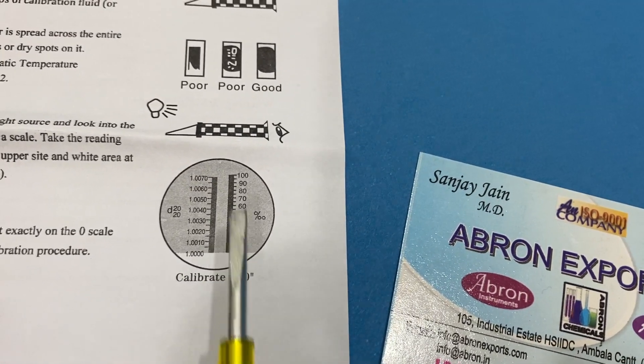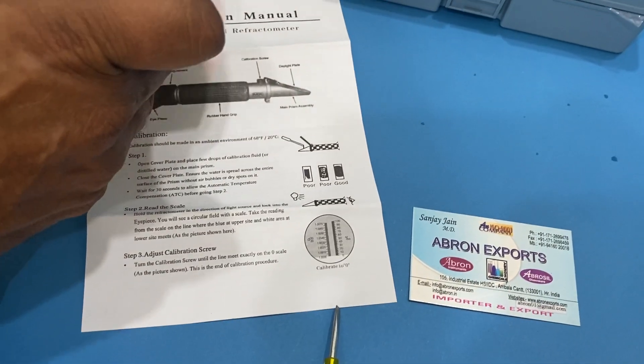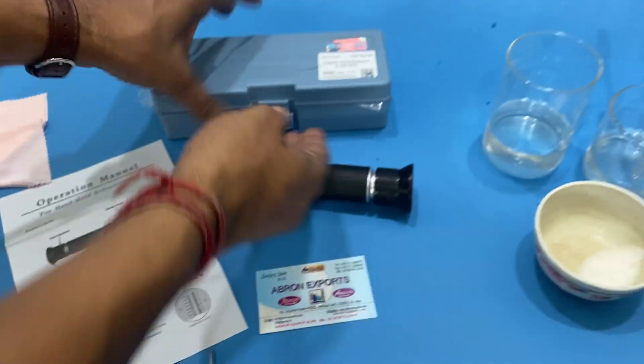I have a cloth — I can clean both sides and then view again. Now the whole field is dark, meaning the reading is below zero. You can see this line is below zero.